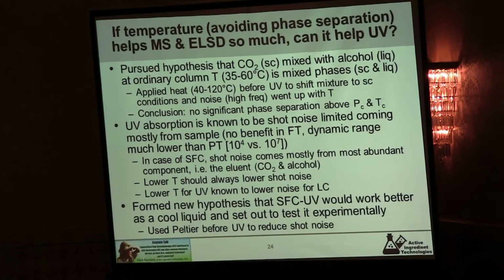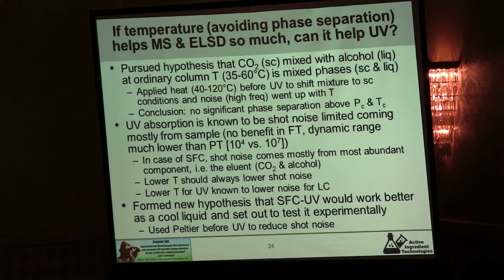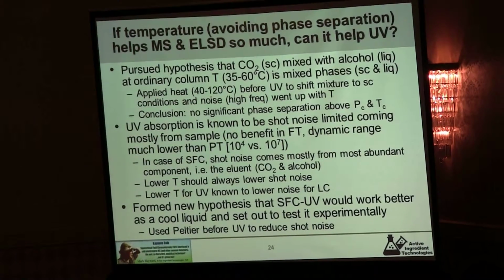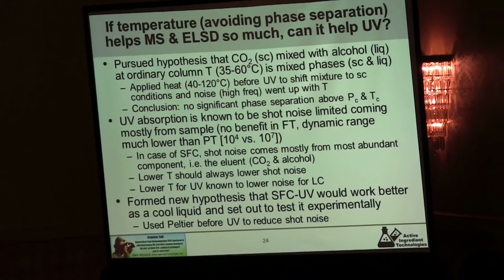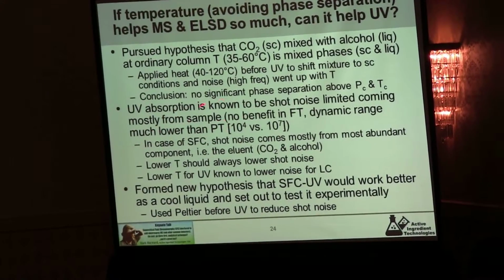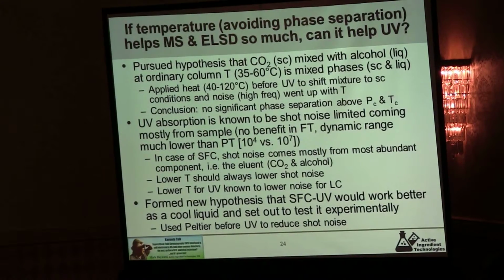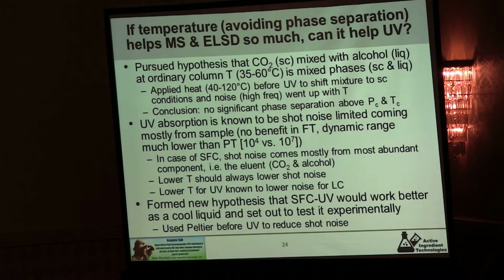All right, so what about UV? UV is different. We can't control the temperature nearly as much there. What we do know about UV is it's generally shot noise limited. So we may want to take a different approach altogether here.